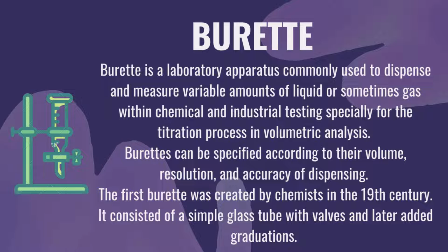This should be carefully observed at eye level, ensuring that the liquid is free of bubbles and the reading is taken at the bottom of the meniscus. The delivered volume is the difference between the initial and final readings of the reagent.